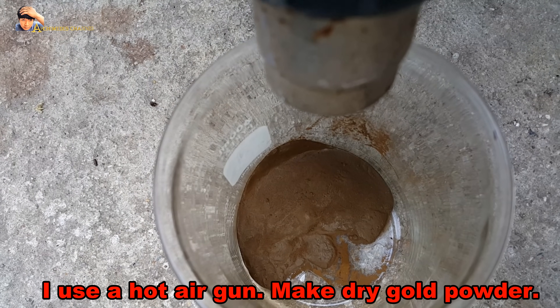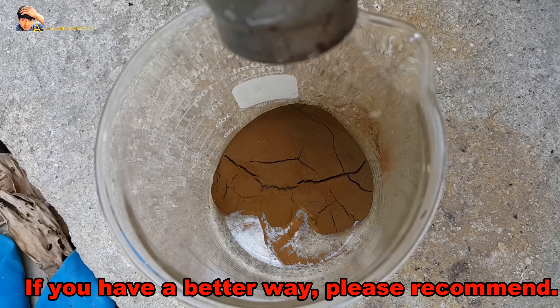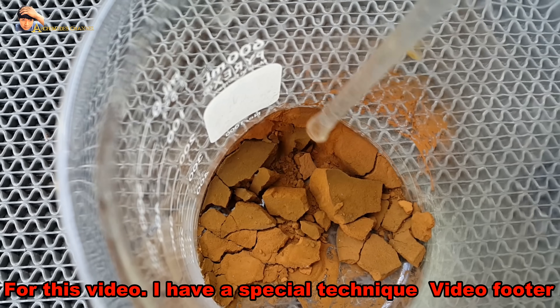I use a hot air gun to make dry gold powder. Gold powder does not splash. If you have a better way, please recommend — to be useful for everyone.